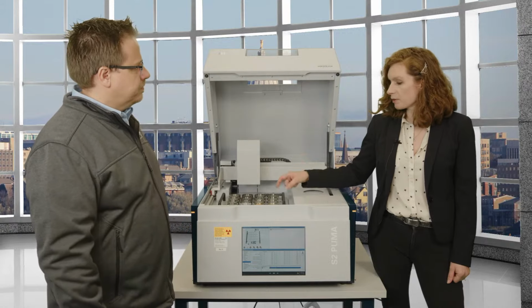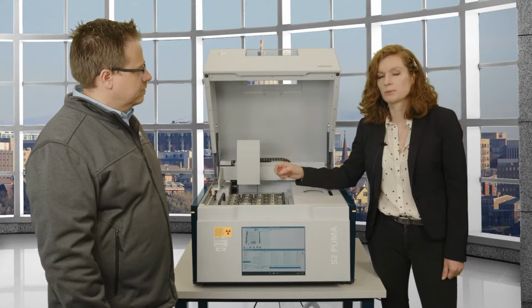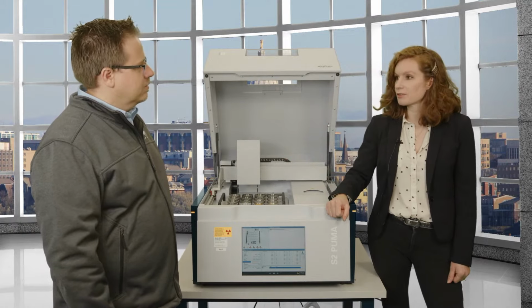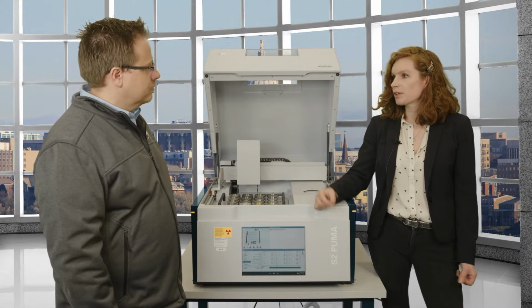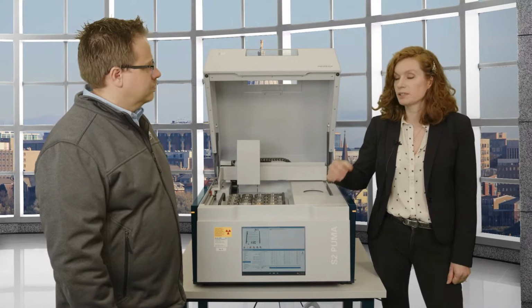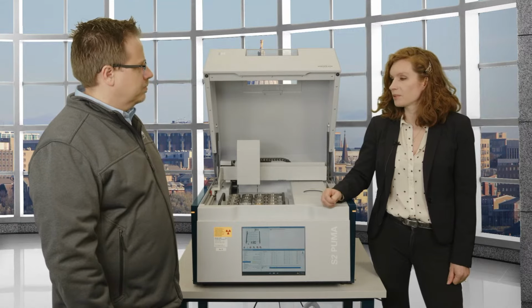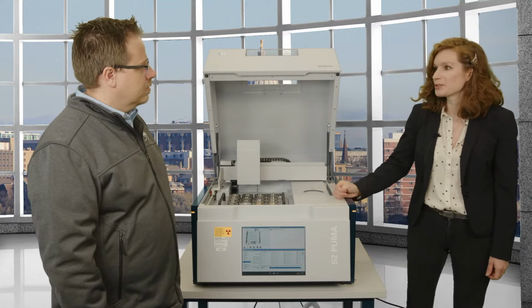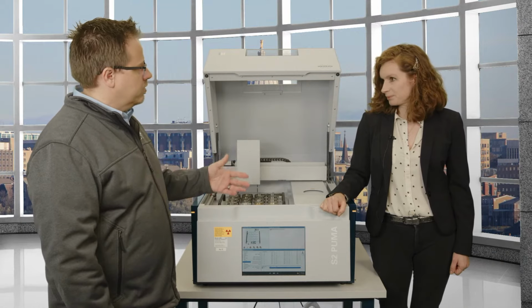And sometimes those systems are referenced, not the S2 Puma, but an EDXRF system. Right? So in the oil industry, ASTM D2622 requires a WD system. When we make a new machine, we also test that they all pass, because it would make no sense to have a machine that doesn't pass very frequently used methods. So this machine would be capable of something like an oil test.